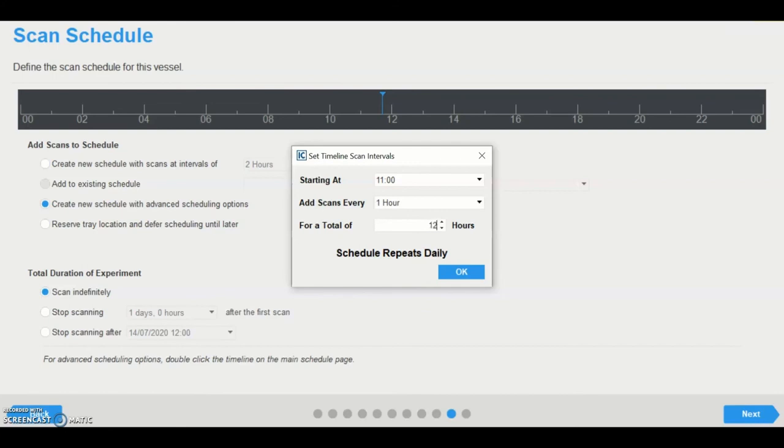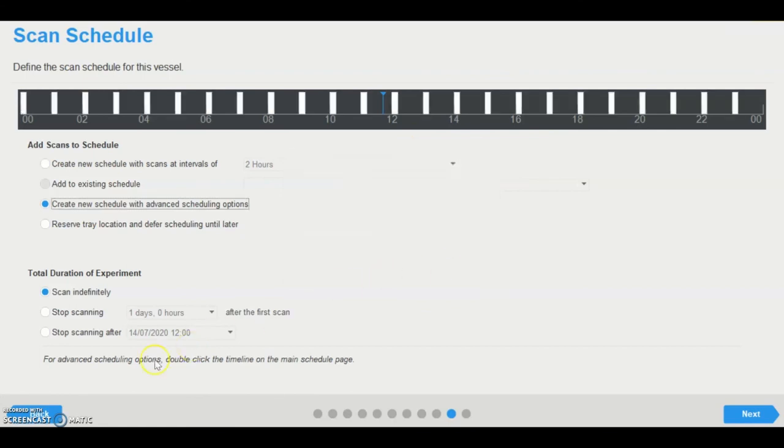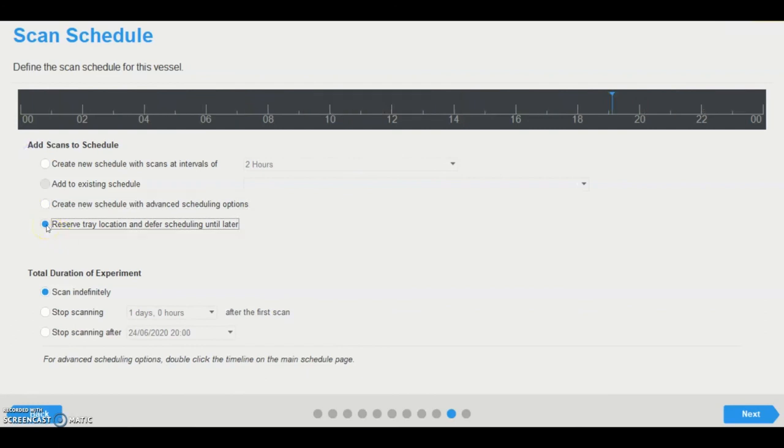In this example, choosing a total of 12 hours means that the vessel will be scanned every hour until 11 PM. However, it is important to note that the schedule repeats daily. So in this example, scanning will recommence at 11 AM the next day for another 12 hours. Leaving the window of scanning for a total of 24 hours will fill the timeline. Individual scans can also be added to the timeline by clicking. The scheduling option is also available in the schedule overview by double-clicking the timeline. A user can also reserve a tray location and defer scanning until later, with vessel scheduling performed in the schedule overview by double-clicking the timeline.